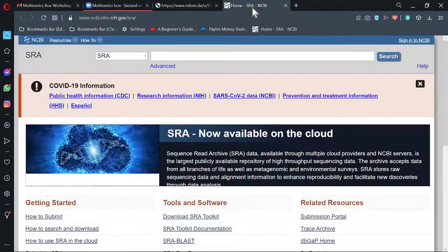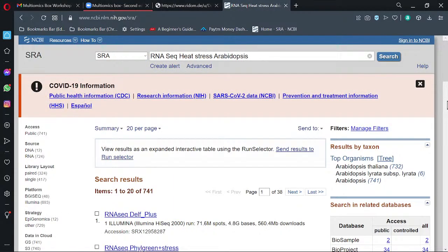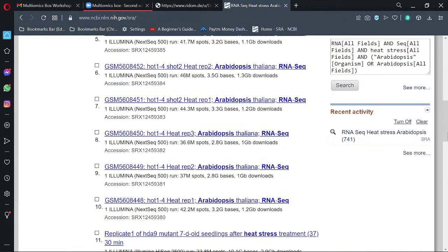Excuse me, Dr. Saurabh, can you suggest some tools for de novo assembly? For de novo assembly, there are a number of tools available: ABySS, Trinity. Trinity is good. ABySS, SOAPdenovo. SPAdes is another one. Yeah, I used around those.